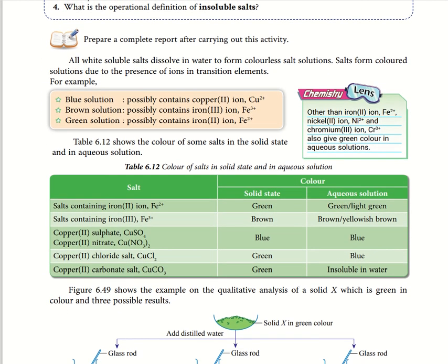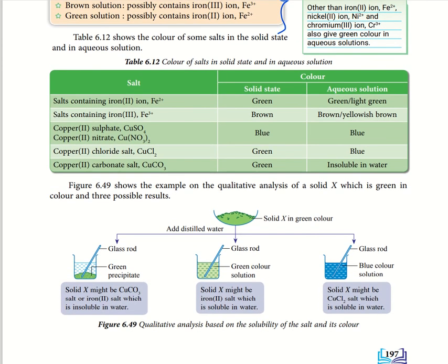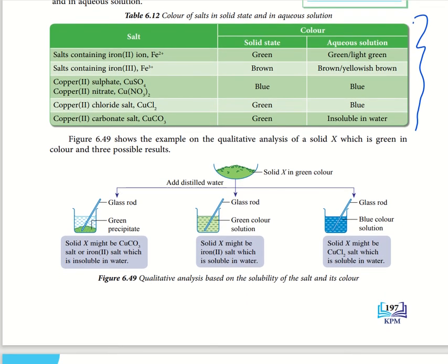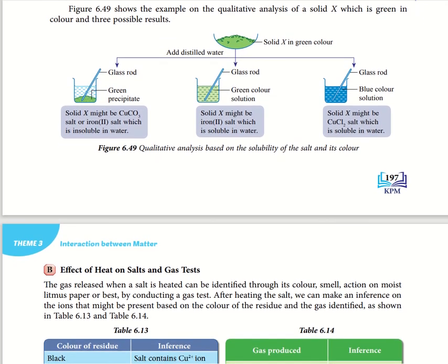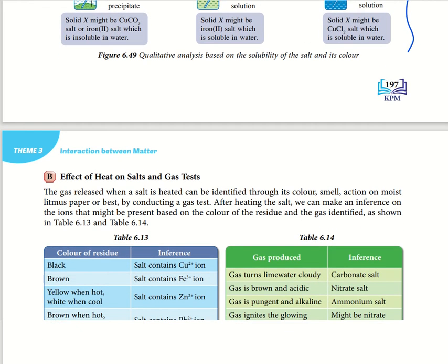Next, this one is like I mentioned before. This is the color mentioned just now. This is the step to see the color and the solubility.